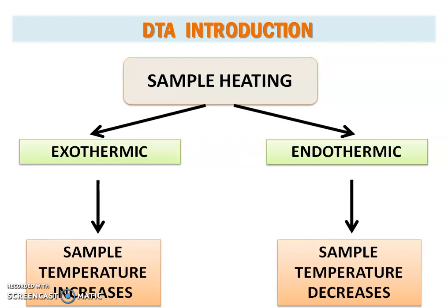So what's your main takeaway from this slide? Exothermic reactions will cause the sample temperature to increase, whereas endothermic reactions will cause the sample temperature to fall.